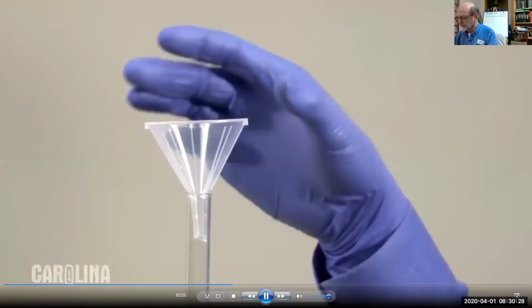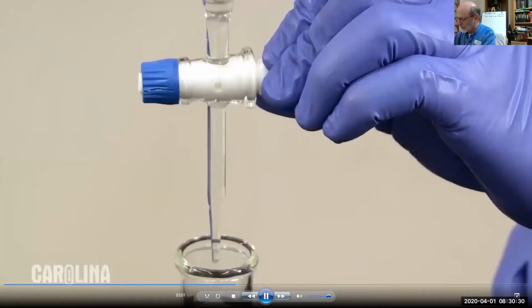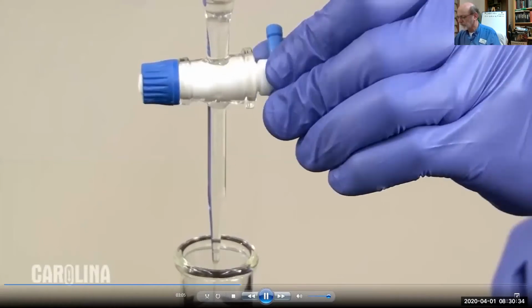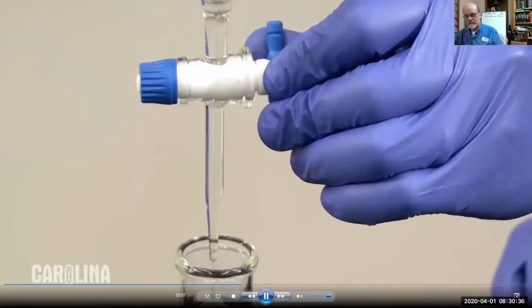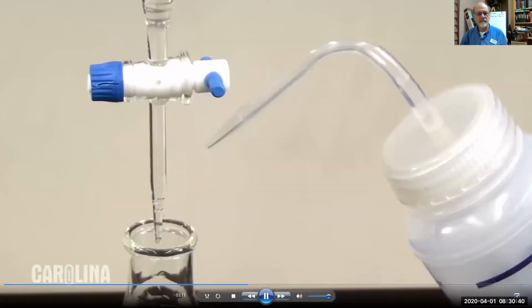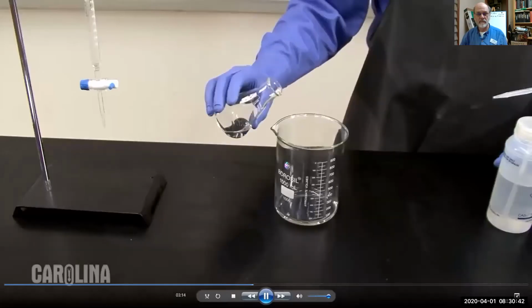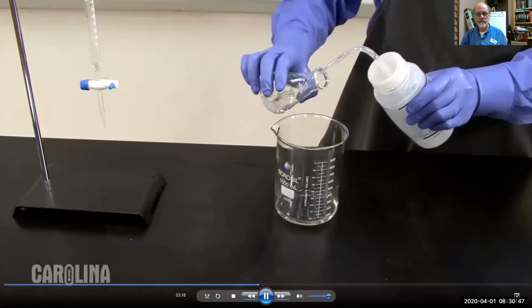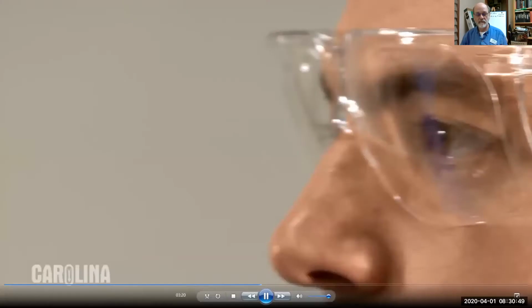Remove the funnel. Place the Erlenmeyer flask under the tip and open the stopcock to allow a few milliliters of titrant to flow through, releasing any trapped air. Rinse the tip of the burette with water. Empty the liquid into a waste container and thoroughly rinse the flask. It is not necessary to dry the flask. Record your starting volume.